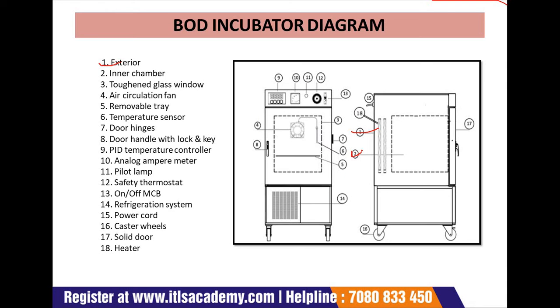This one is the second, so second is the inner chamber. Third one is the toughened glass window, which is here. And fourth one is the air circulation fan. You can see it in this picture.